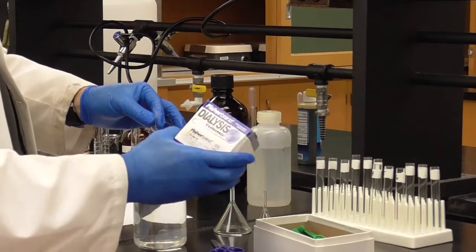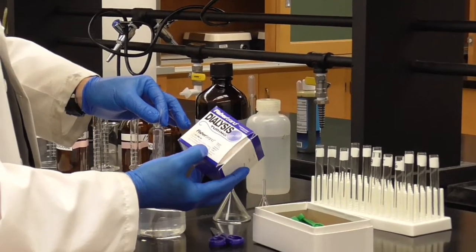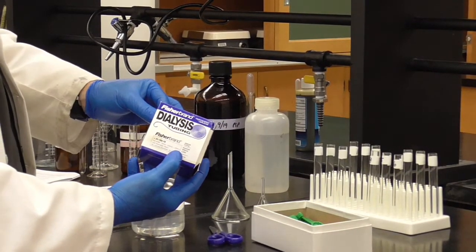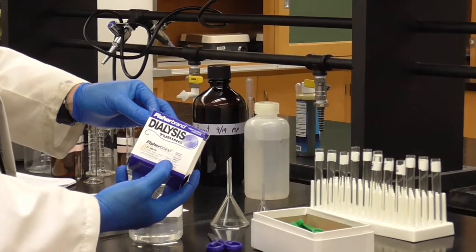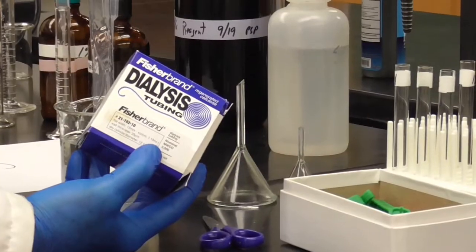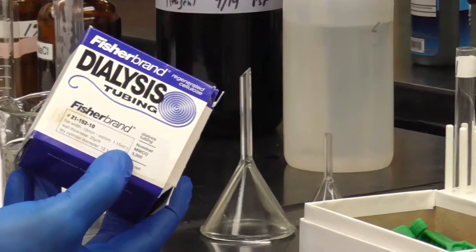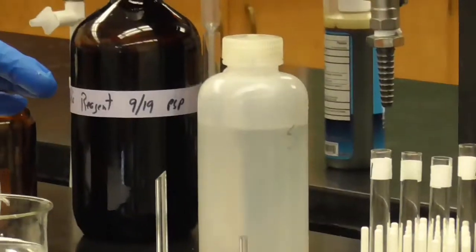This one in particular, if I look at the label, it says MWCO 3500. That means molecular weight cutoff 3,500. So if molecules, on average, are smaller than 3,500, they're probably going to be able to pass through this tubing. If they're larger than 3,500 grams per mole, then they're probably going to be too big to pass through it. So it's approximately the cutoff point of whether someone can get through it or not.